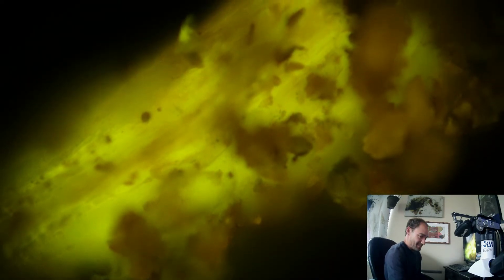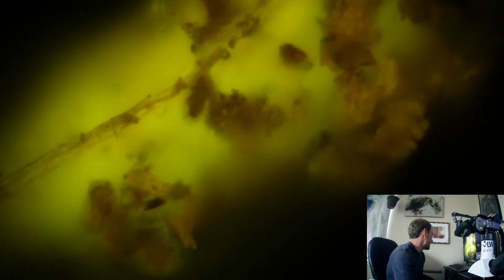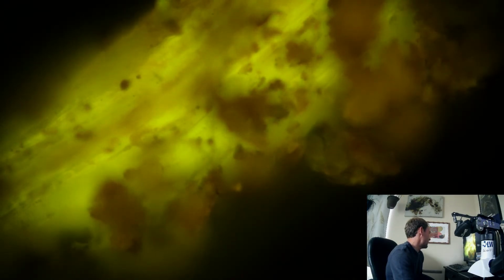I'm moving it just slightly. Let's see if we can get right over here. I think that's a root hair laying on the outside. Trying to get a good focus on the inside.